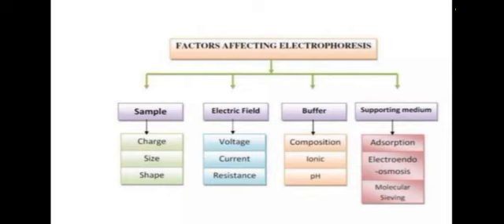Third one, buffer composition, ionic strength, and pH also affect capillary electrophoresis. Next, last one, supporting medium. In the supporting medium and capillary, capillary adsorption, electroosmosis, and molecular sieving affect capillary electrophoresis. These are the factors affecting electrophoresis.